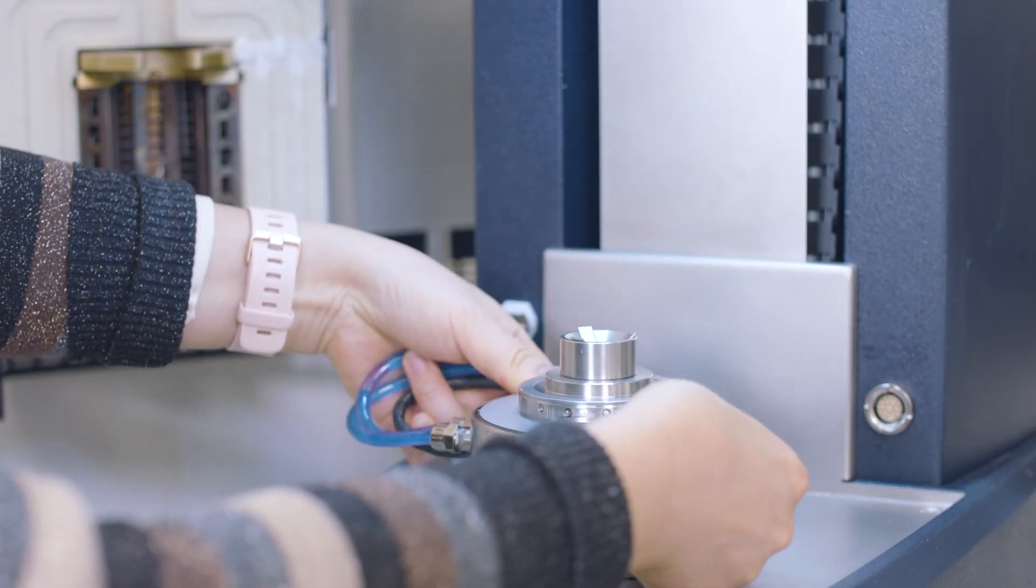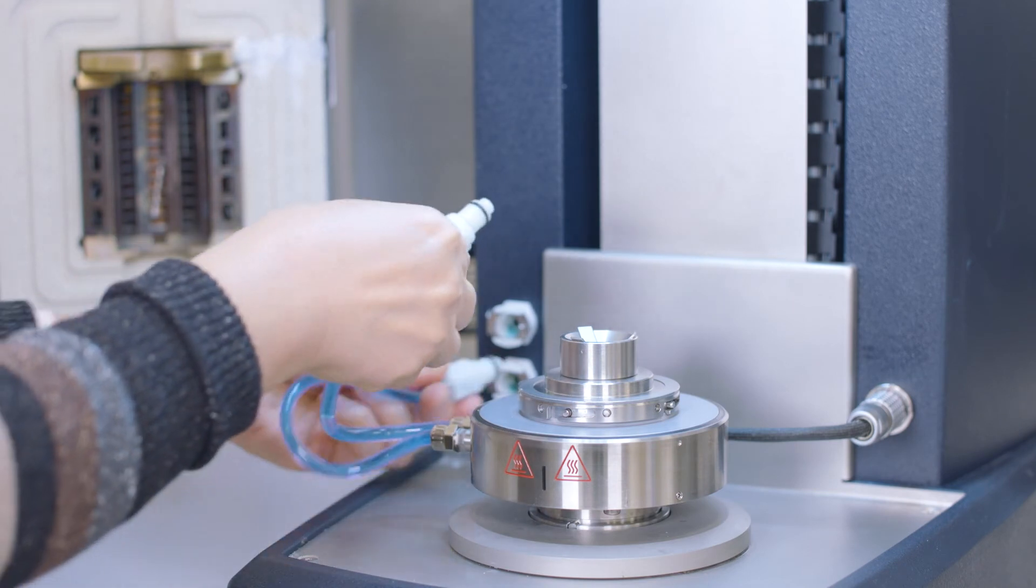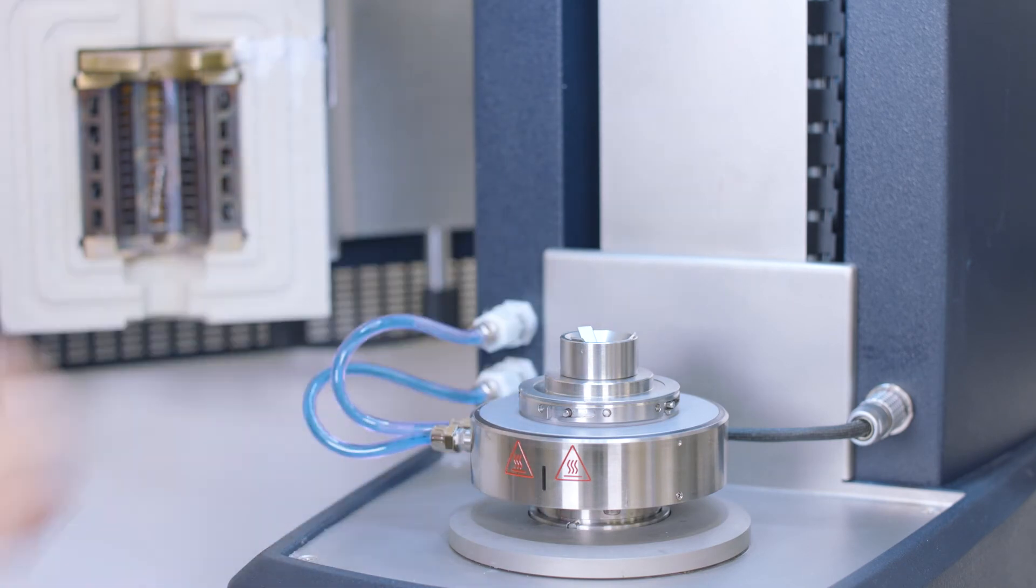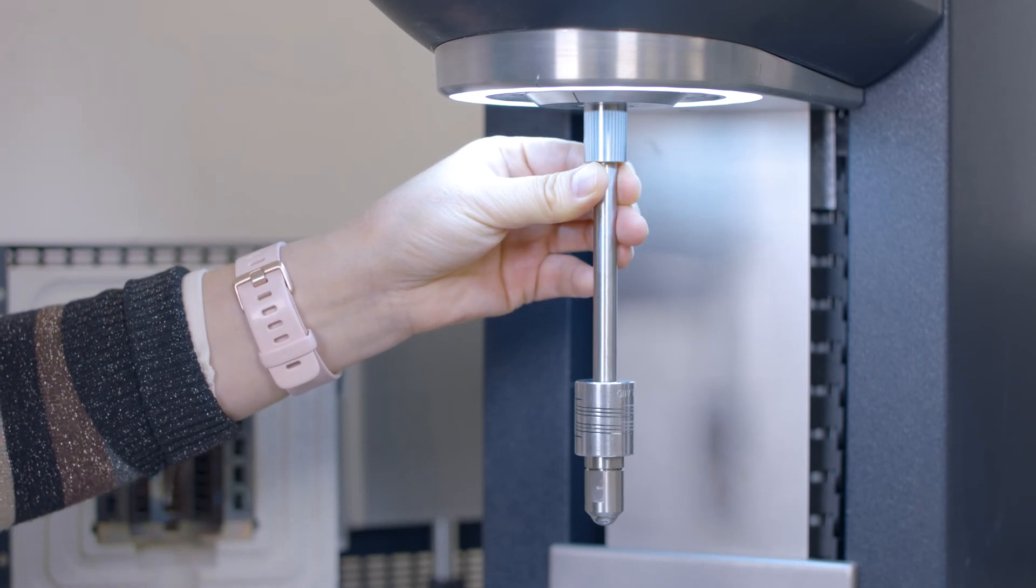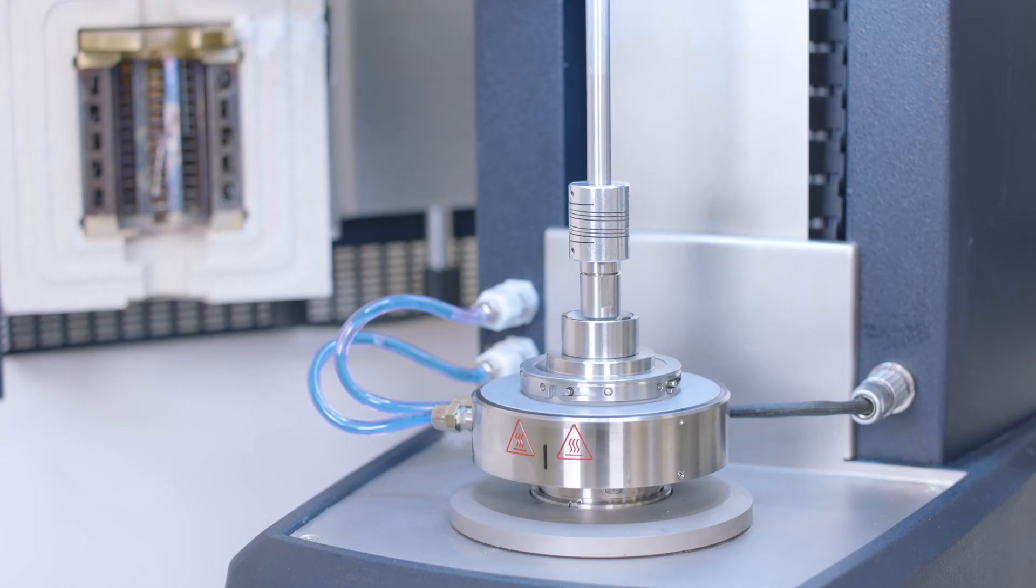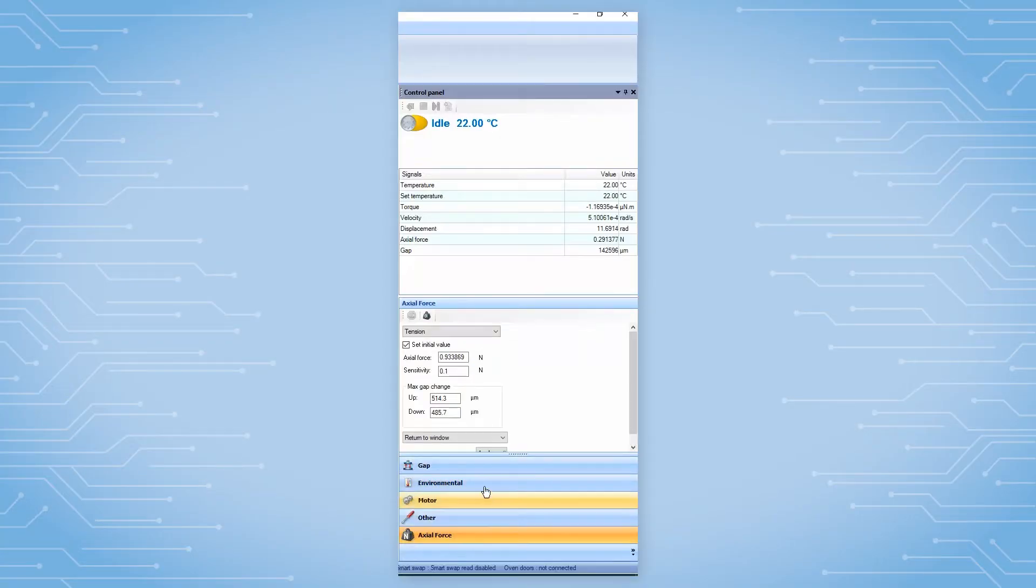Setting up a tribo-rheometry test on a Discovery hybrid rheometer is very straightforward. First of all, after attaching the upper and lower geometry to the rheometer, users need to zero the gap. If needed, from the TRIO software control panel, also zero the axial force.